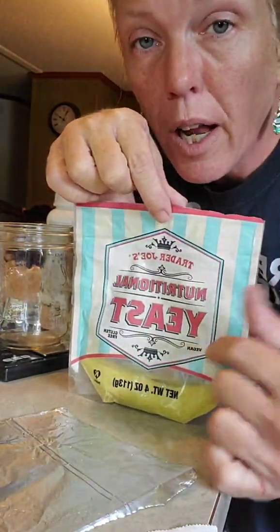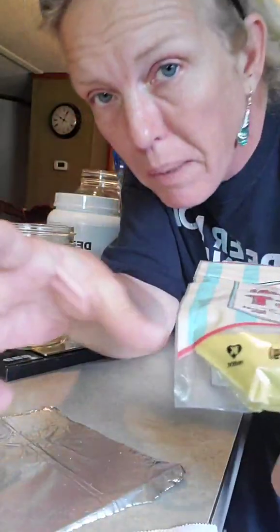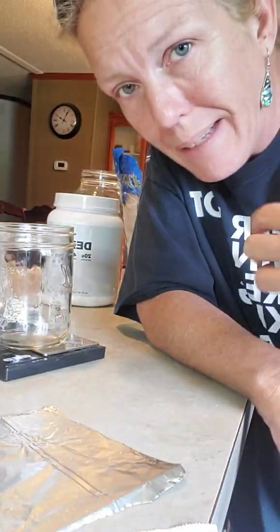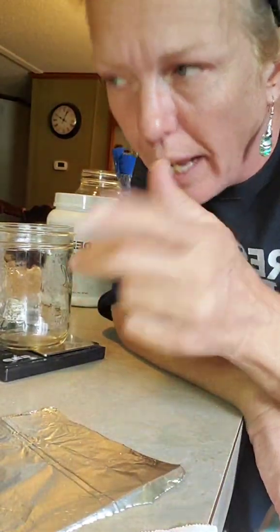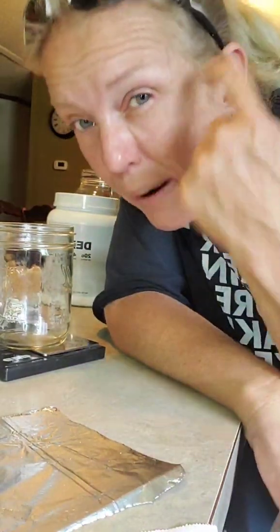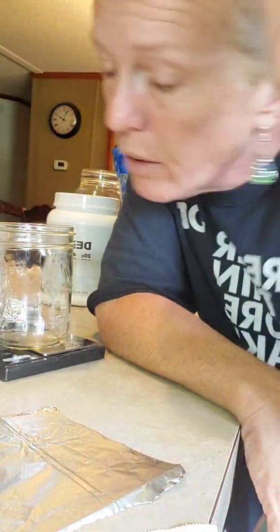When I get this nutritional yeast, I put it in the blender and hit pulse, and I get it down to where instead of being flakes like it is when you get it, it's a powder. Okay? It makes it more available for the mycelium to consume than giant flakes. And those giant flakes can darken, as you saw on those plates. The yeast does get dark, and it can make your brain think, oh no, I've got contamination, when you really don't. It's really okay.